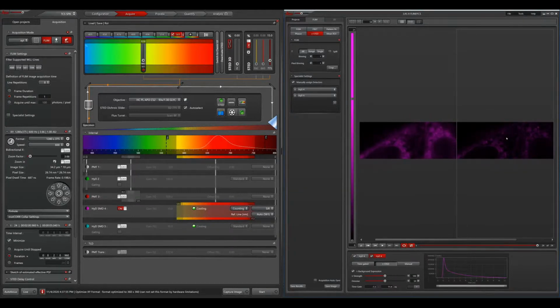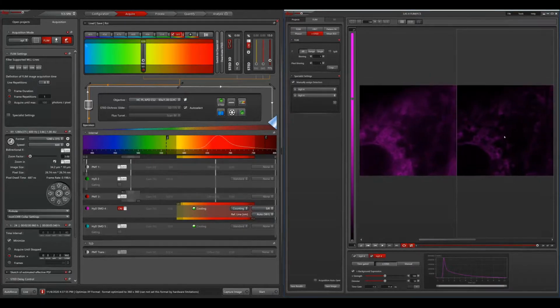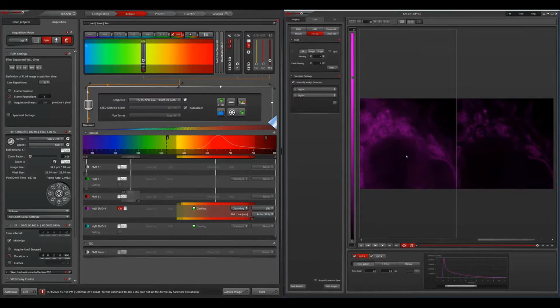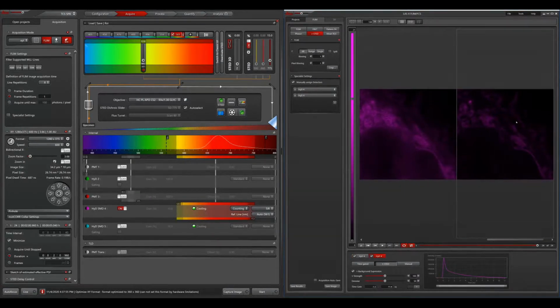And what you can see already here is that we have achieved a significantly higher resolution, and also our contrast is a lot better, as we can not just improve the resolution thanks to the phasor plot, but we can also identify lifetimes which are uncorrelated with the STED depletion laser. So that means if you activate the depletion laser and certain lifetime components in your sample are not affected by it, that means that they're actually not coming from the dye that you're interested in. So you can treat them as background, as you can separate them easily thanks to the phasor, which you will hear more about also tomorrow. So that's done by the system automatically.